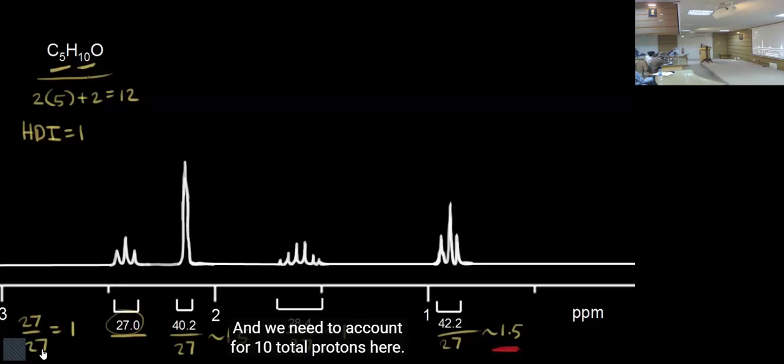Most often in natural product chemistry, almost like all small molecules, we can identify one proton. All these integrations depend on your identification of that one as a one proton, and then everything follows. We usually do not have these higher numbers.